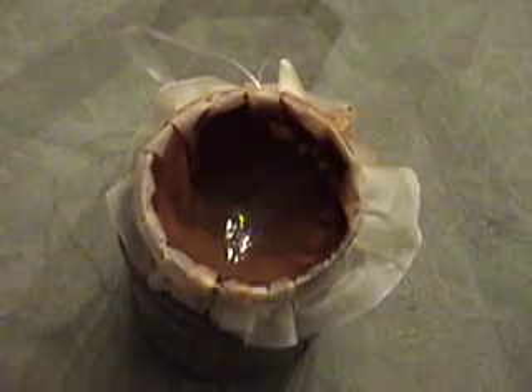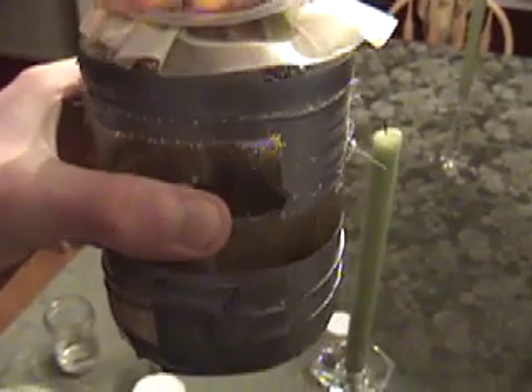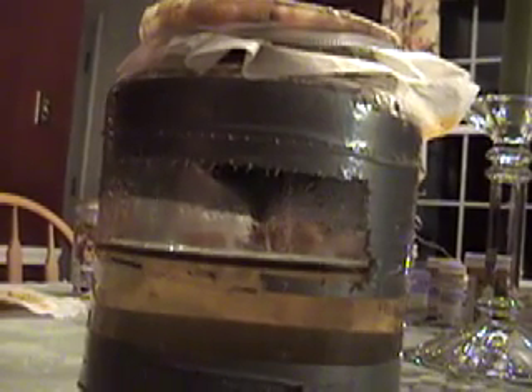This is what you get after you have filtered it. I've got all of my water in here that we do not want, and all of our good rust is in there. So basically you just take this off.